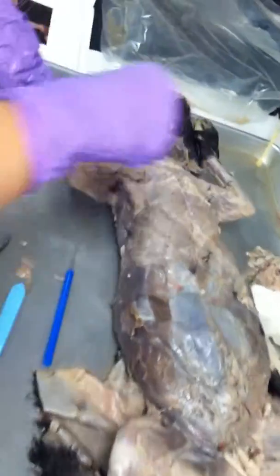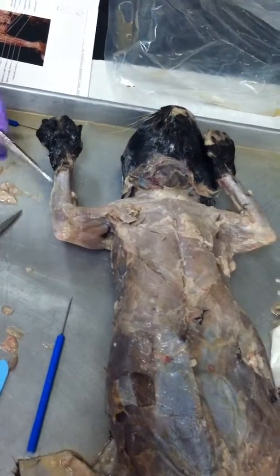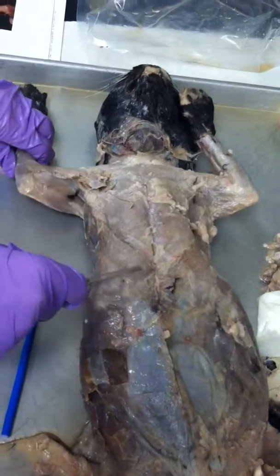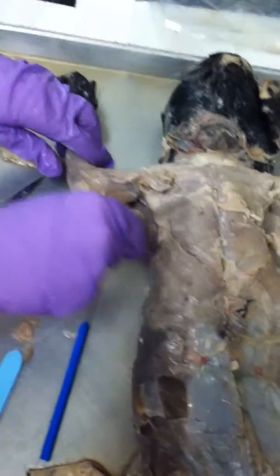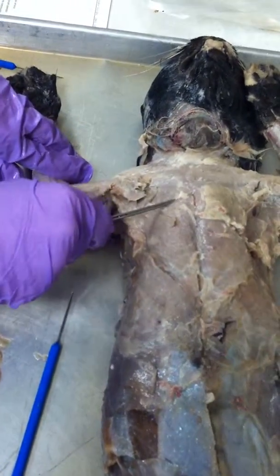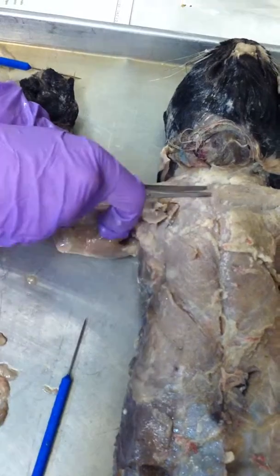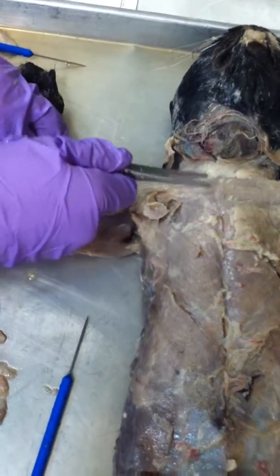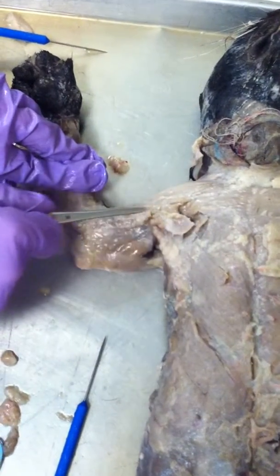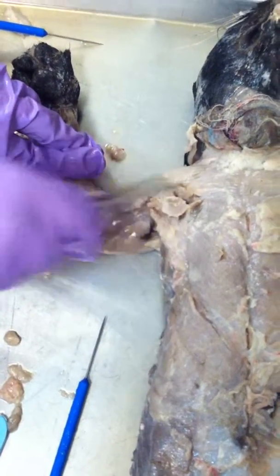Looking at the pectoral region of the cat, we have muscles in the human that are pec major and pec minor. In the cats, it's a little different. We have a muscle running from the xiphoid process to the humerus, so we call this xiphihumeralis. Here's pec major, or pec minor in the cat. Pec major actually is from here to here, and what we see on top of it is pectoantebrachialis, running from the pectoral region to the antebrachium. So this is pectoantebrachialis right here, and pec major is deep to that and on either side.